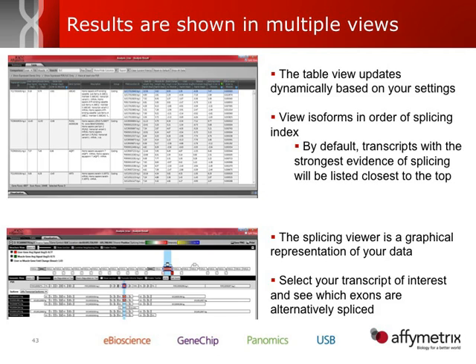We get a table view. Now we have each of the transcript clusters, which is sort of like a gene. They're all grouped together. And then within that, now we'll have each individual exon level or splice junction probe set listed that belongs to each particular gene. And again, we'll have things like fold change, p-values, and this other thing called splicing index, which is sort of like an exon level fold change, but we do a gene level normalization first. So it takes care of any gene level differences before we look at the exon level differences.